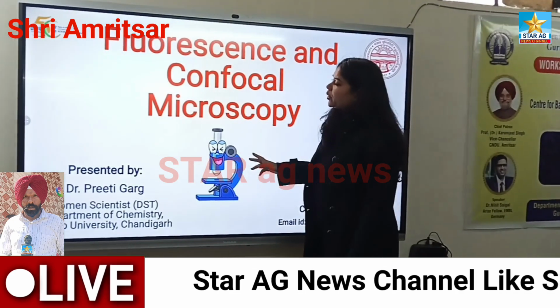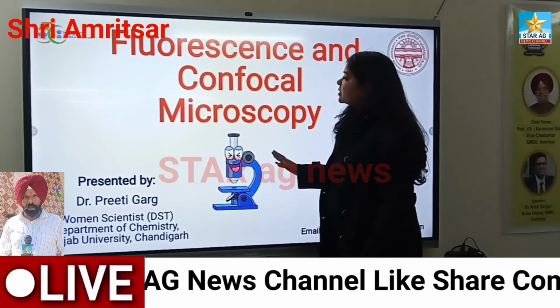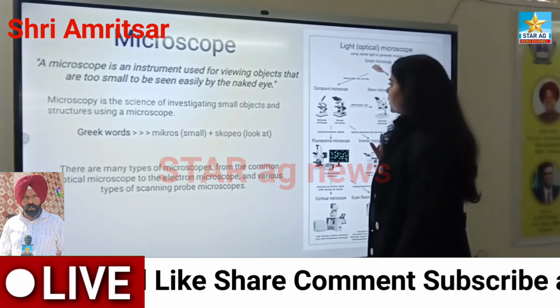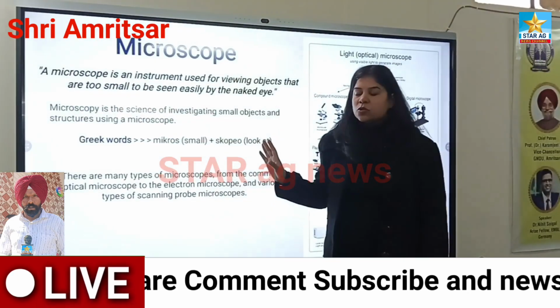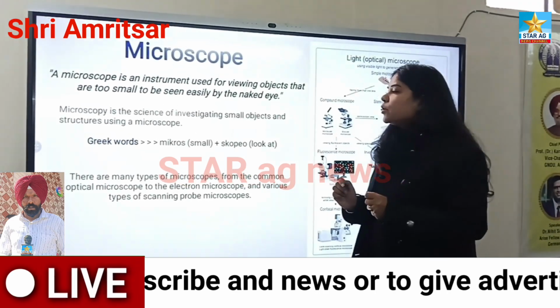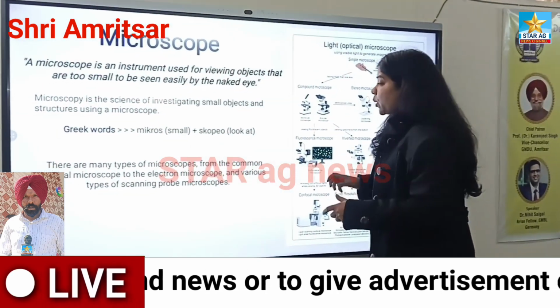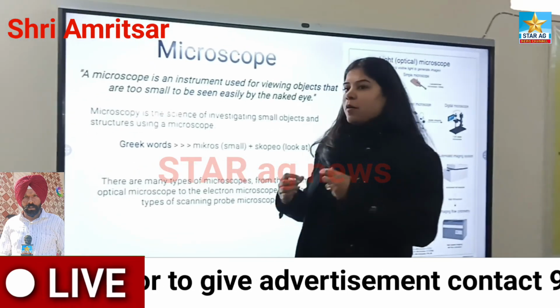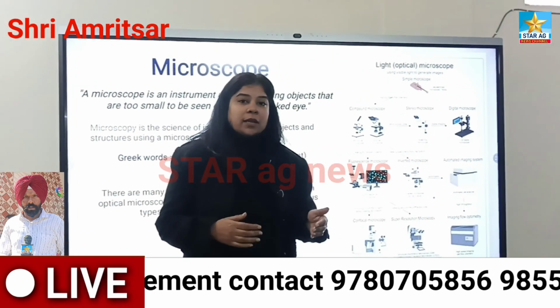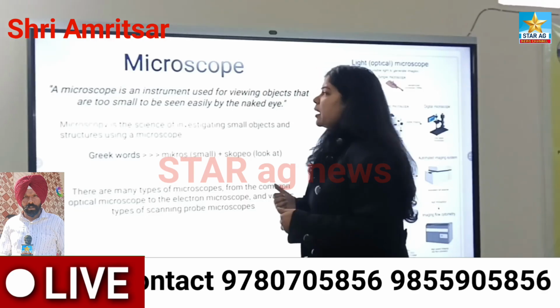Okay. So the topic of today's lecture is fluorescence and confocal microscopy. So you can see what a microscope is. It is an instrument to see a small object that we cannot see with the naked eye. Why do we use a microscope? Because with our naked eye we cannot see small objects like atoms and molecules. So we need a microscope.